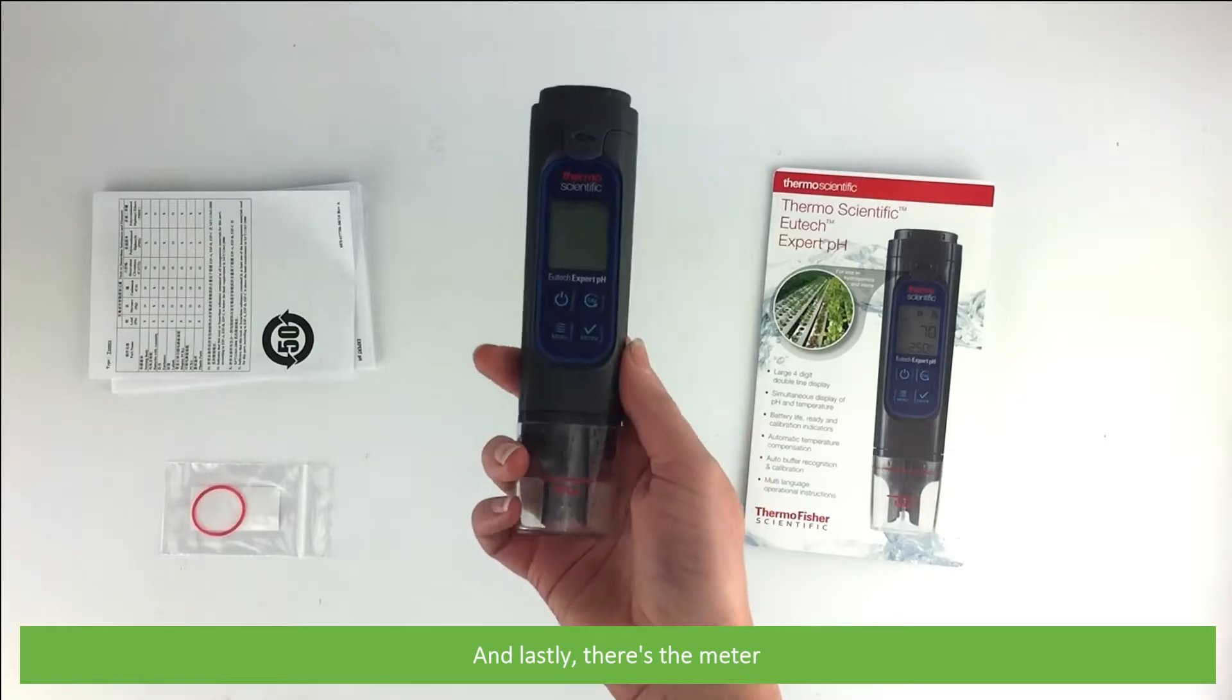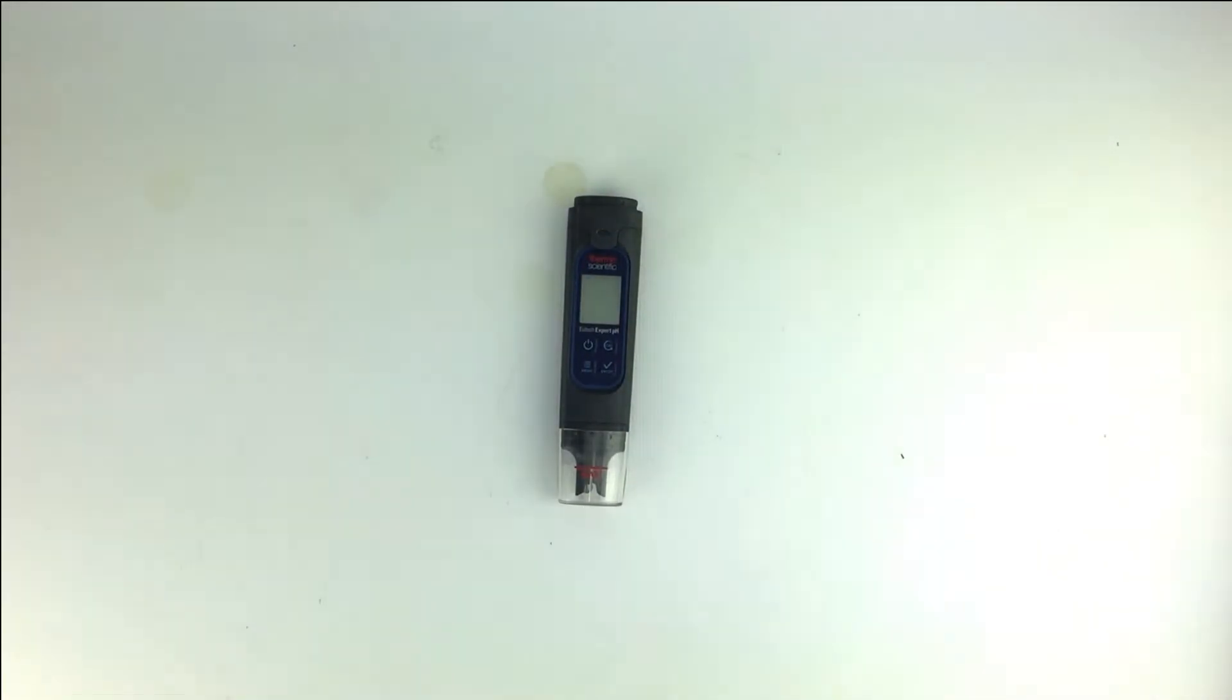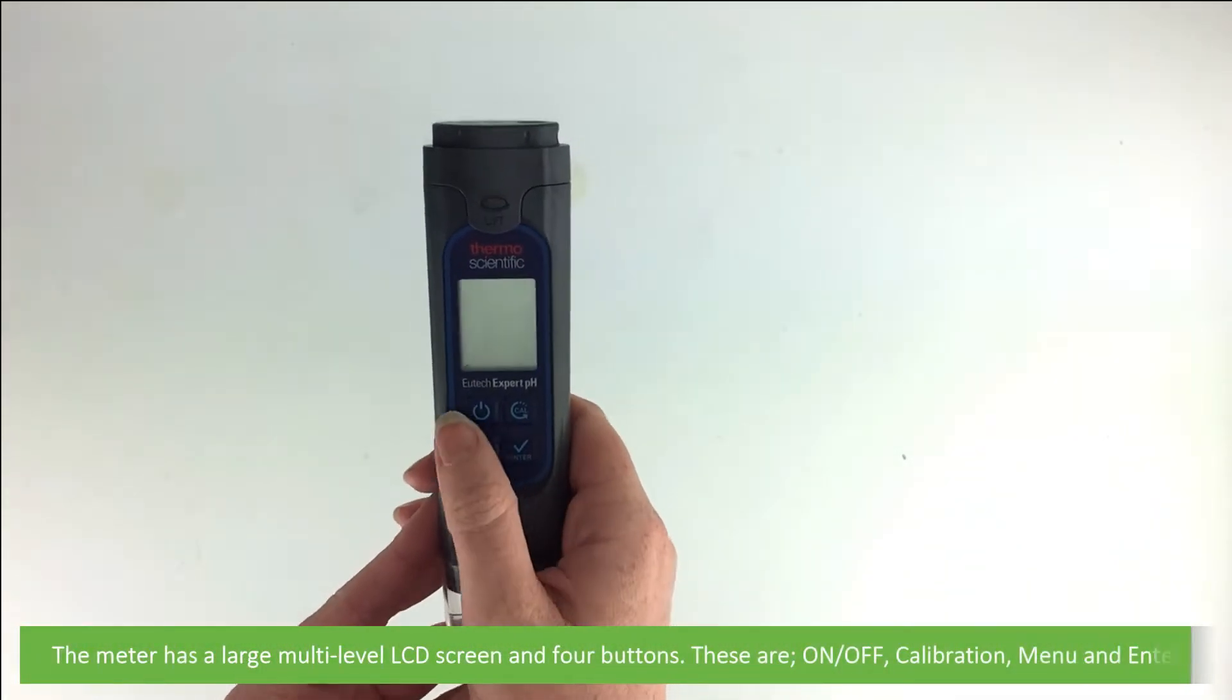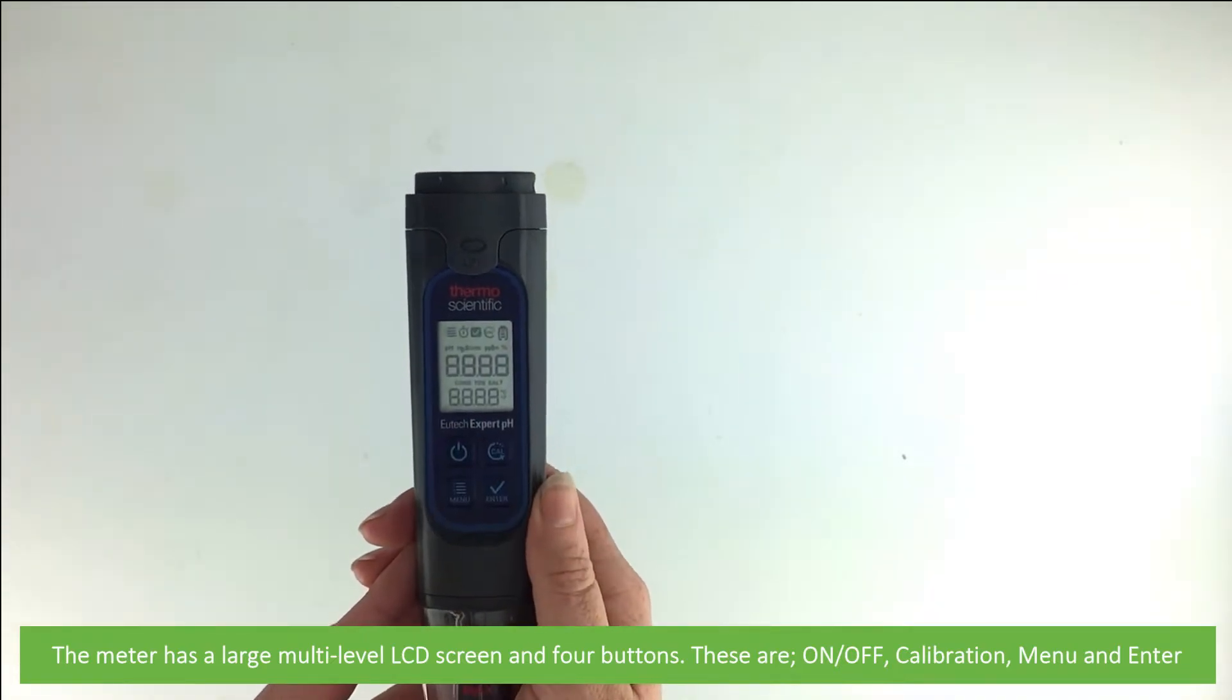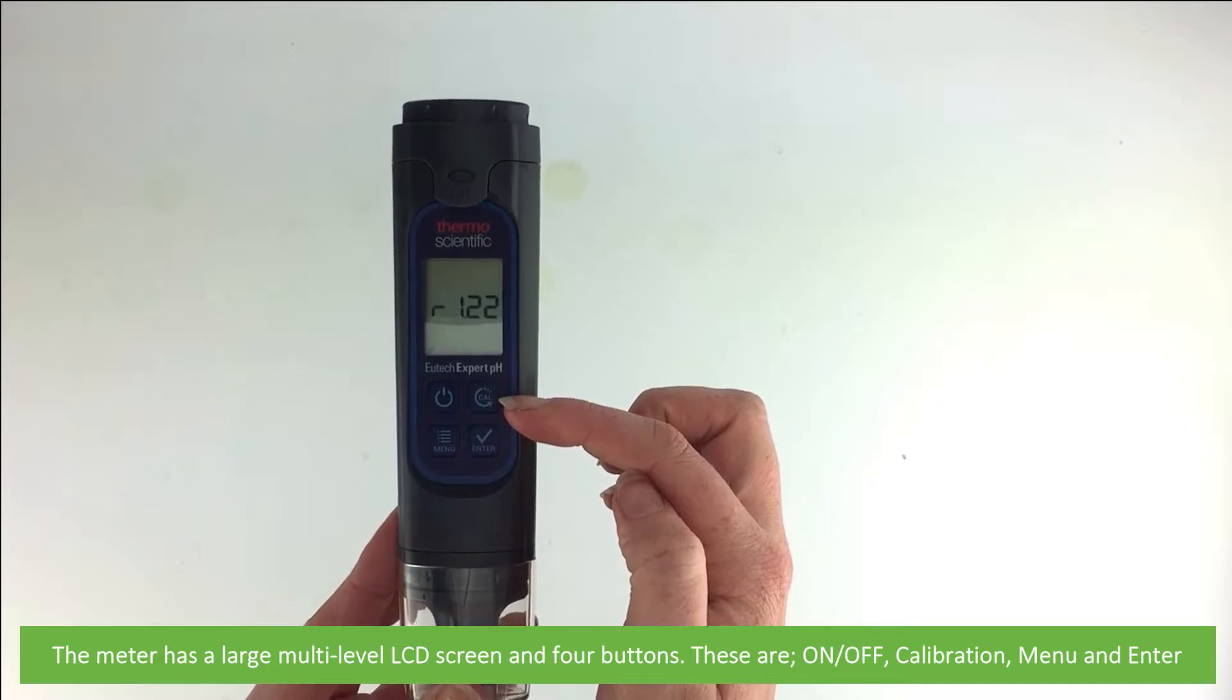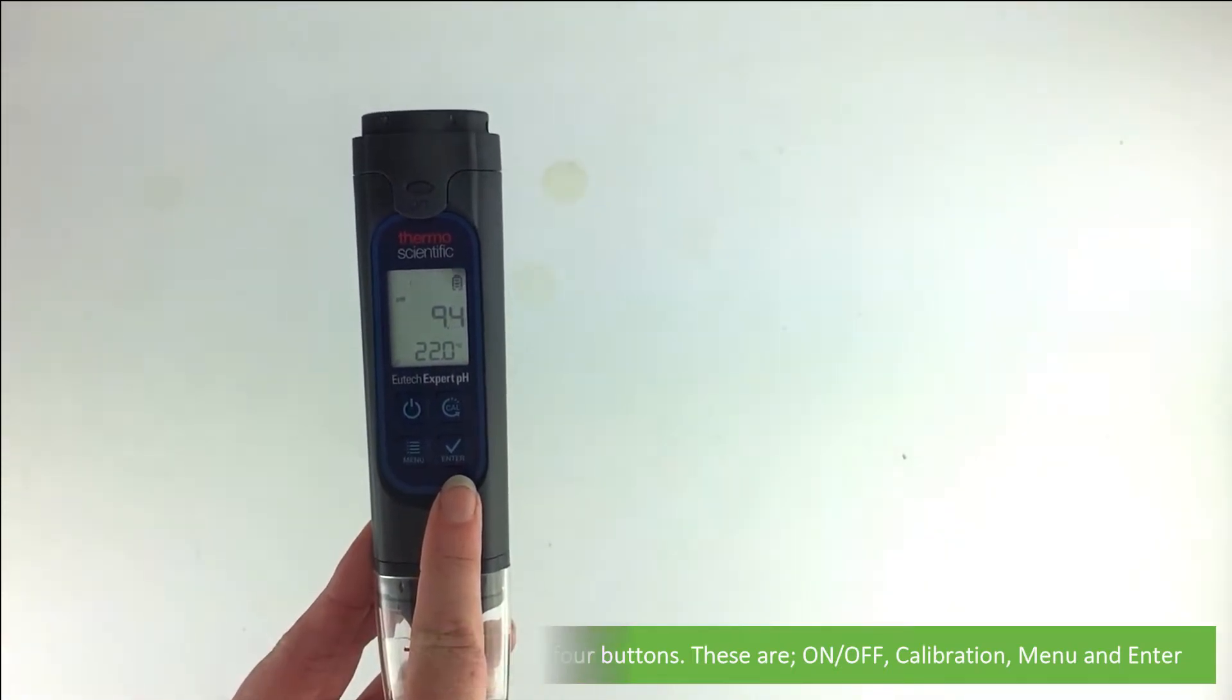And lastly there's the meter. The meter has a large multi-level LCD screen and four buttons. These are on-off, calibration, menu, and enter.